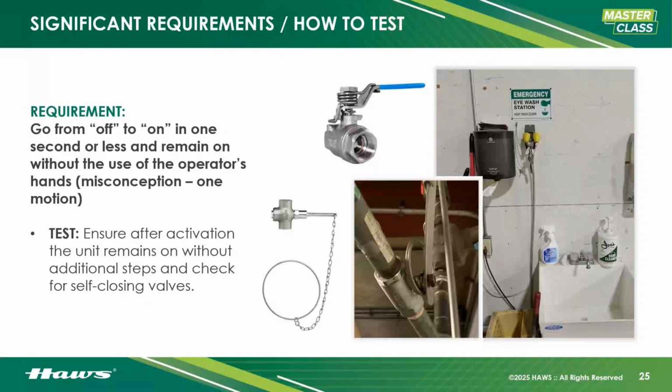All right, now the equipment, again, off to on in 1 second, right? That has to be without the use of the operator's hands. Continued use, right? You can activate the equipment, but you have to be able to let it go, and the unit has to maintain functionality and the water flow without the use of the operator's hands.